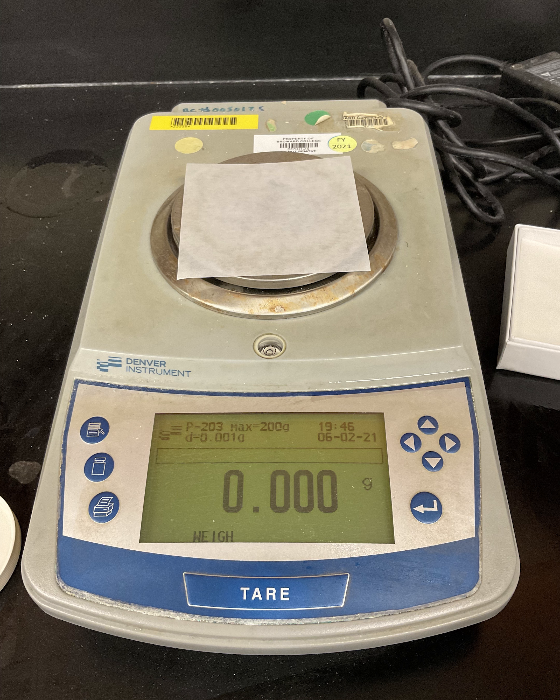To measure the mass, you want to protect the scale by placing the weighing paper first. If you don't want to count the mass of the weighing paper, you need to tare it. The scale has a tare button, which you use to zero out the weighing paper.